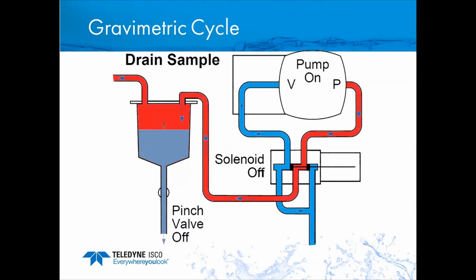Once the weight is delivered, it will again reactivate the pump, pressurize the chamber, and open up the pinch valve to push the liquid down into the bottle below.